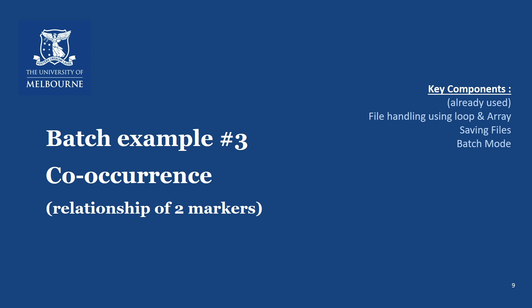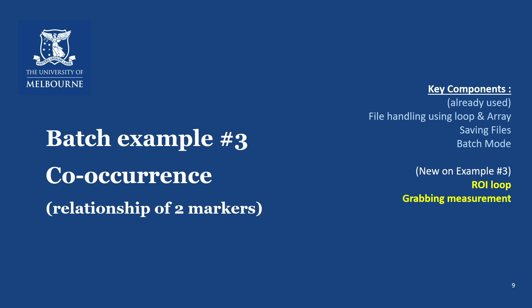In order to do this, we will need the components which we have used in the previous example, such as loop and array in batch mode. And also more components such as how to use the ROI manager and how to loop ROIs. And also how to grab measurements from the ROI. We will also learn how to log data onto our custom data table.